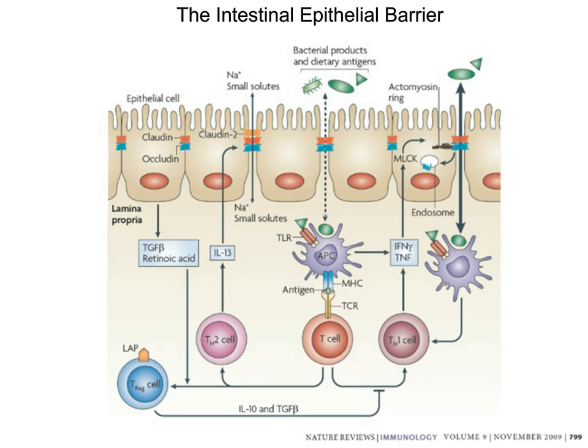And you can see the tight junctions marked by the claudin 2 and then the red and the blue proteins. And so these are junctions, or adhesive junctions, between two cells that really hold them in really close proximity. And they prevent things like dietary antigens and bacteria from moving across the epithelium. And in the event that these tight junctions get disrupted, things can move across the epithelium. They get sensed by the underlying immune system and can start an inflammatory cascade. And so this tight epithelial barrier is really critical for normal homeostasis of the gut.